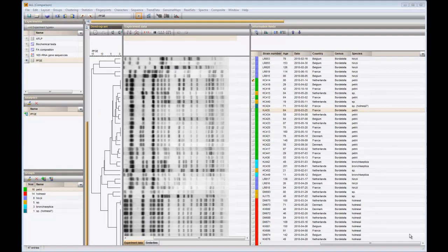In this demo, I will show how we can edit bands on fingerprints directly in the comparison window.